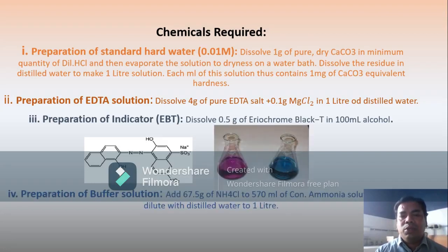So please see here, when the eriochrome black T indicator is added to the water, the color changes from wine red to blue color. ఇక్కడ చూడండి, ఇక్కడ మనకు బిఫోర్ టైట్రేషన్, ఆఫ్టర్ టైట్రేషన్. సో బిఫోర్ టైట్రేషన్ the color is wine red color. After titrating with EDTA, the color changes from wine red to blue color. So this is how we can determine the end point.